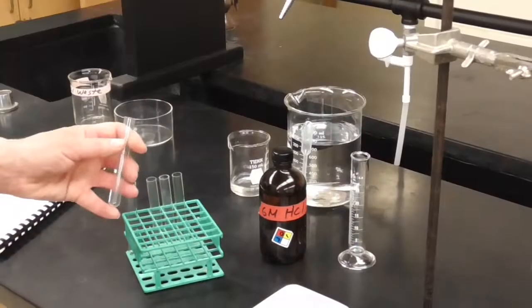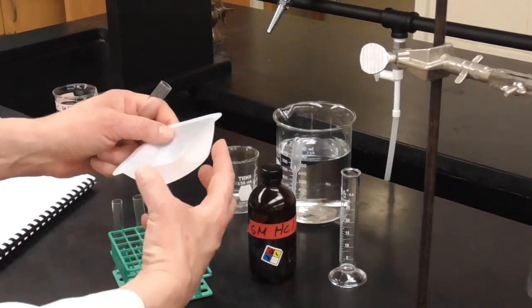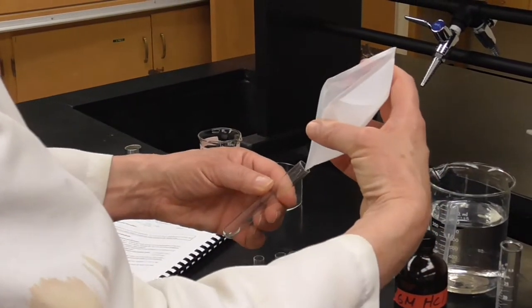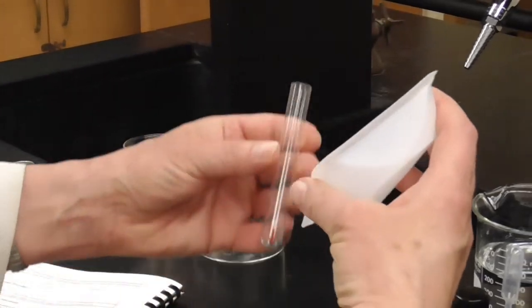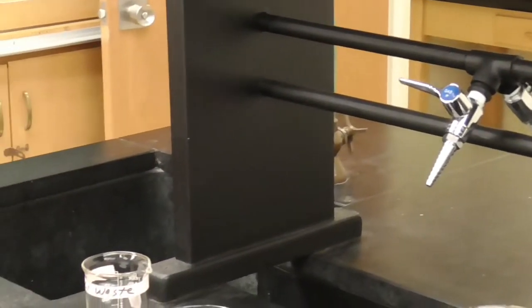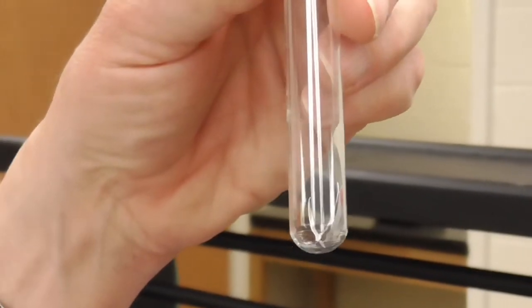I'm going to take this over to the apparatus. Now I'm going to transfer the pieces of aluminum, the soda can, into a small test tube. And there we go. Did I drop one? There should be... Yes, there are 3 pieces in there. There are 3 small pieces of soda can in there.